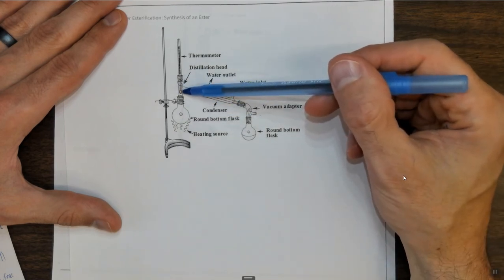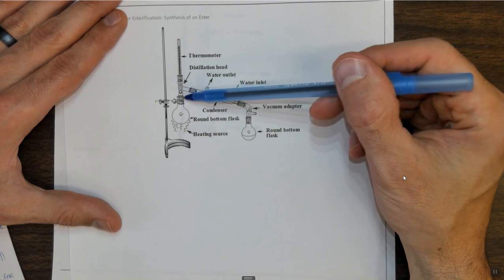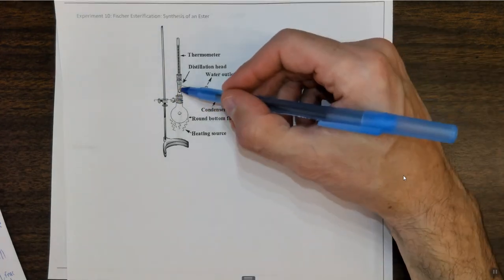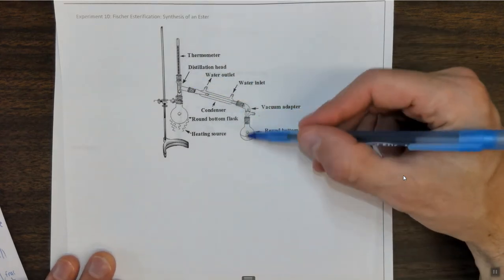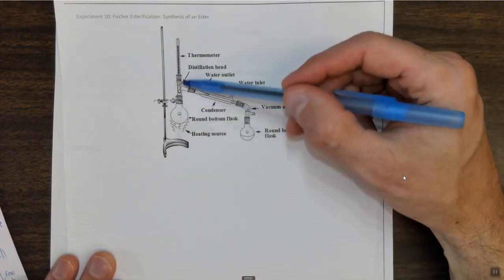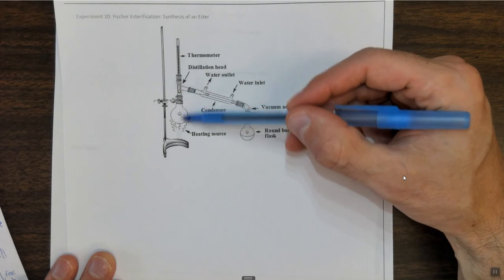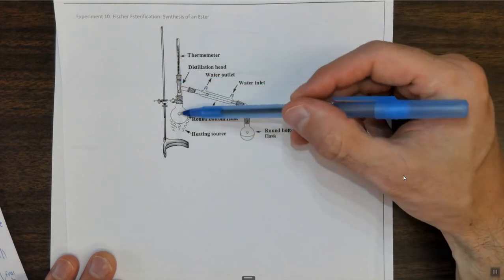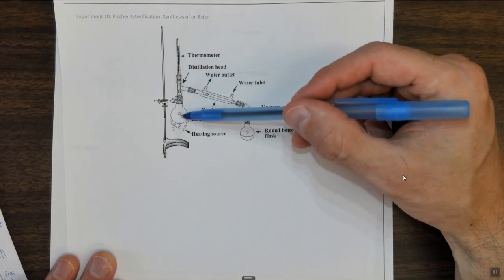Then we want to measure the boiling point of the isopropyl acetate. So boiling point is one way that we are going to monitor what our product is. So simply by reading the thermometer, when your second fraction is dripping, right, so we let the ether boil out, then the temperature will either start to rise and the dripping hopefully will stop for a short time, or in an ideal world it'll go down and then go back up again.